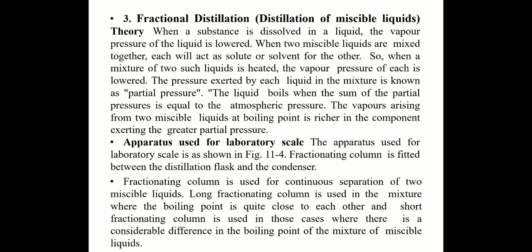Fractionating column is fitted between the distillation flask and the condenser. Fractionating column is used for continuous separation of two miscible liquids. Long fractionating column is used in the mixture where the boiling points are quite close to each other, and short fractionating column is used in those cases where there is a considerable difference in the boiling points of the mixture of miscible liquids.